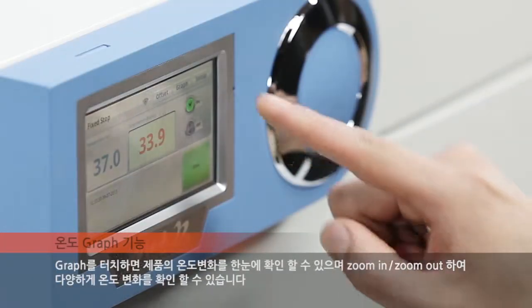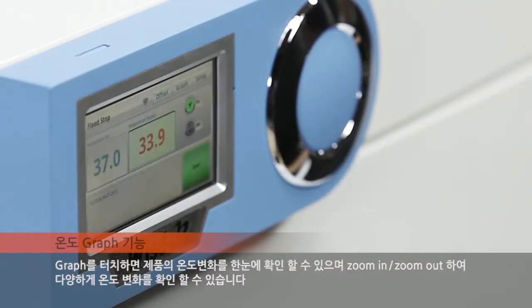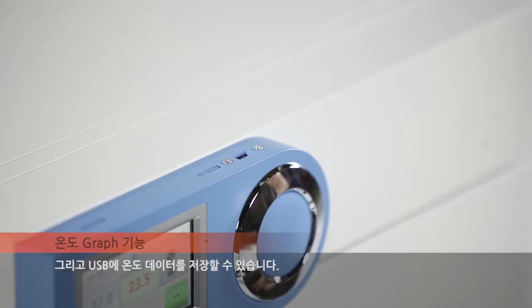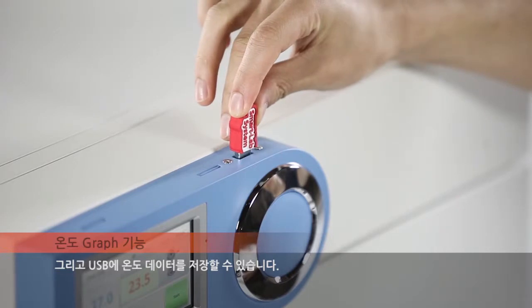By touching the graph, the history of the temperature change in the unit can be seen at a glance, and can also be checked in various formats using zoom in and zoom out. The temperature data can be stored in USB memory as well.